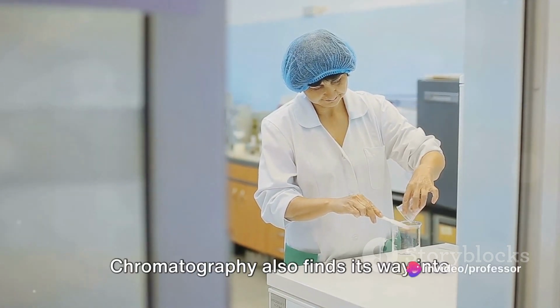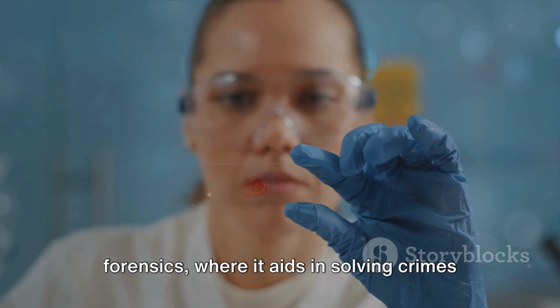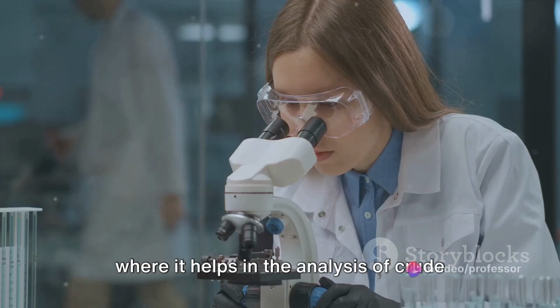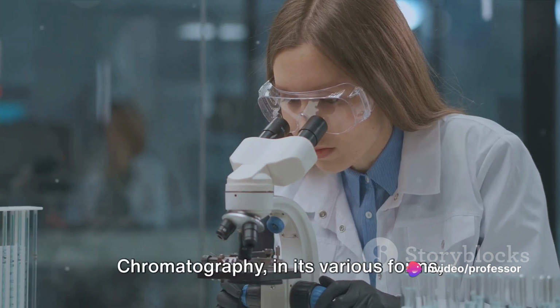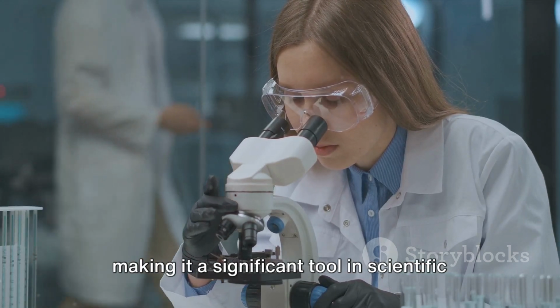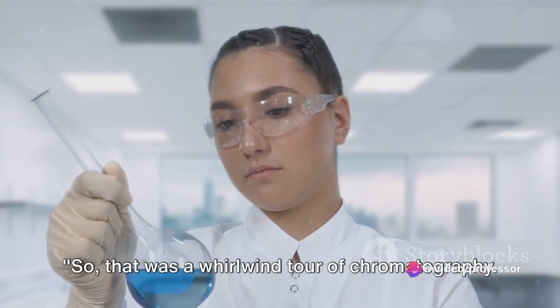Chromatography also finds its way into forensics, where it aids in solving crimes by analyzing substances found at crime scenes, and in the petroleum industry, where it helps in the analysis of crude oil and its derivatives. Chromatography, in its various forms, plays a pivotal role in numerous sectors, making it a significant tool in scientific research and beyond. So, that was a whirlwind tour of chromatography.